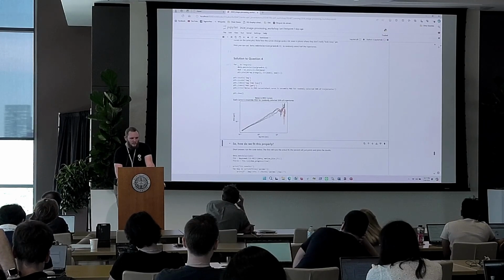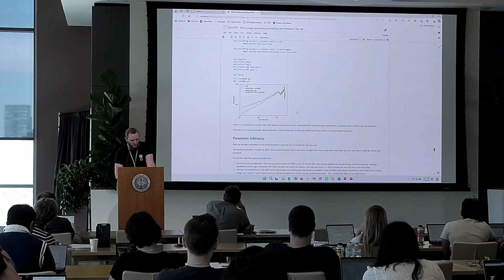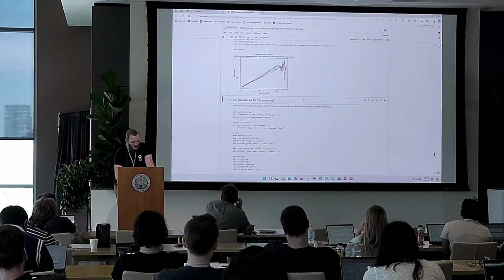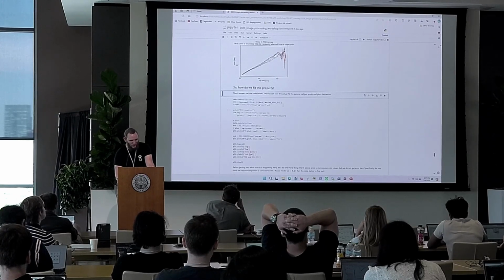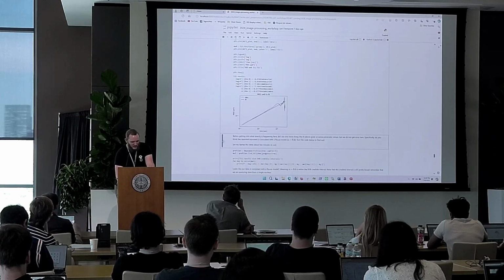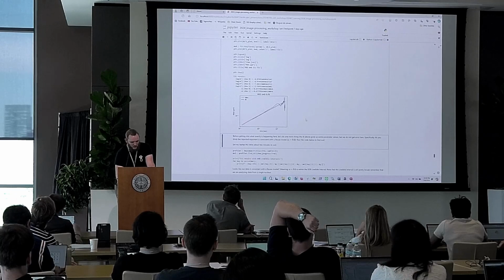And it also means that if you just take this plot and you fit a line to it, you're going to make a significant error, or your estimates will be biased. So to avoid that, you can do your statistics a bit more rigorously. So here it basically says, let's run the code below and figure out after what's happening. This is again a library that I wrote during my PhD. It fits these MSDs essentially, gives you a bunch of parameter values, and correctly takes these correlations into account.